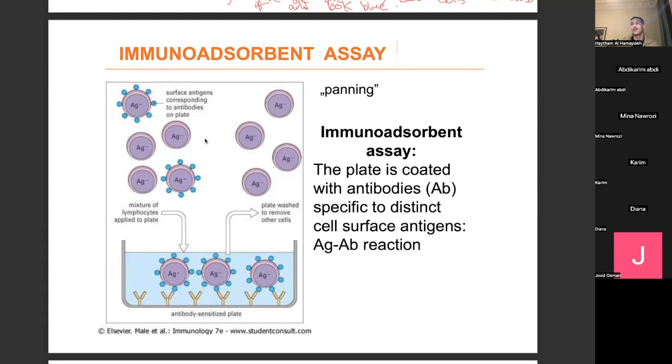If let's say our cell population is filled with lymphocytes, something like CD45. Why? It's because I'll change this example. Fuck it. Let's not concentrate on antigens. Now we are doing negative selection, yes? In this case, we are using antibodies that are able to bind to anything other than CD3, okay?